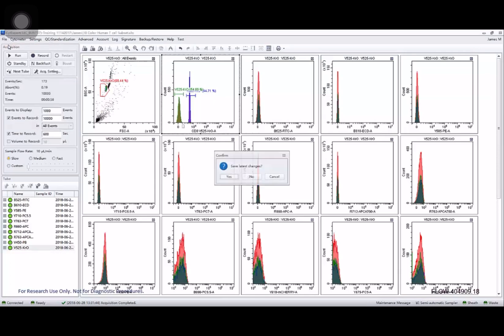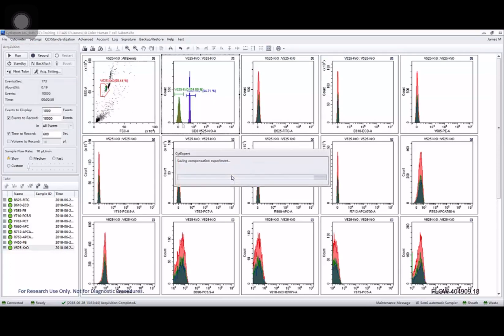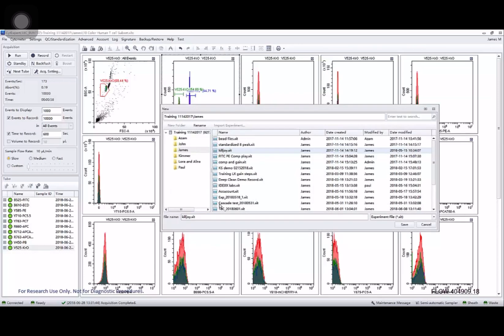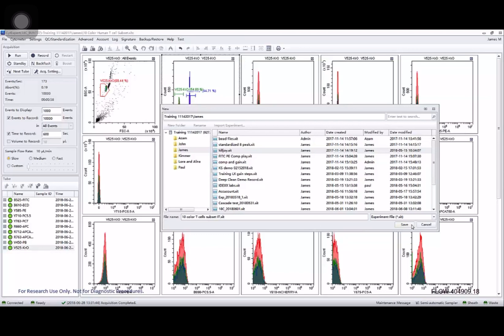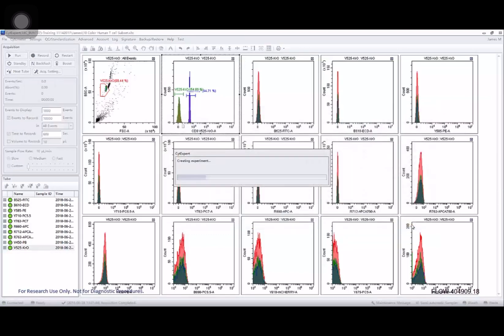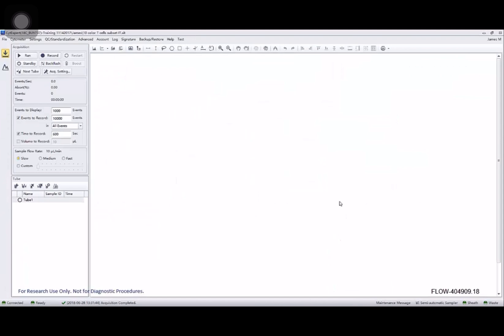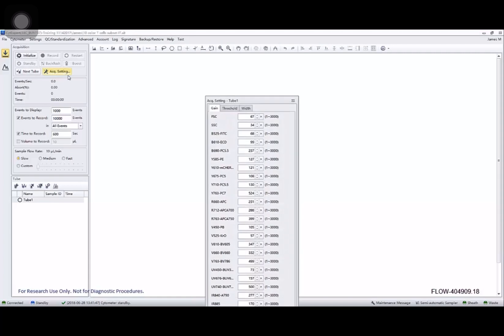And then I'm going to create a new experiment. Save that experiment. And now I get my standard blank experimental layout. Now that we've got that blank experimental layout, let's start looking at what else we can do.